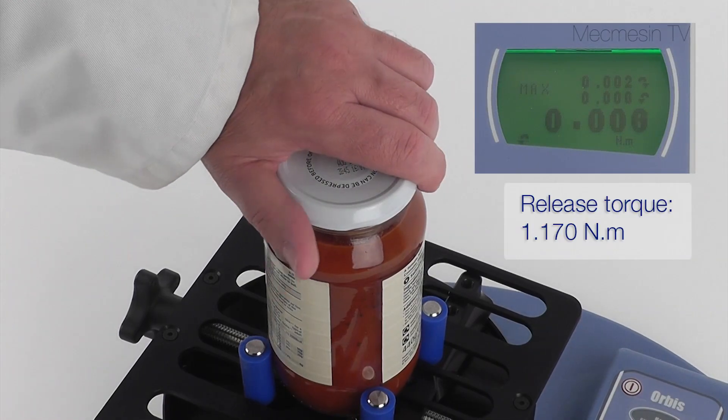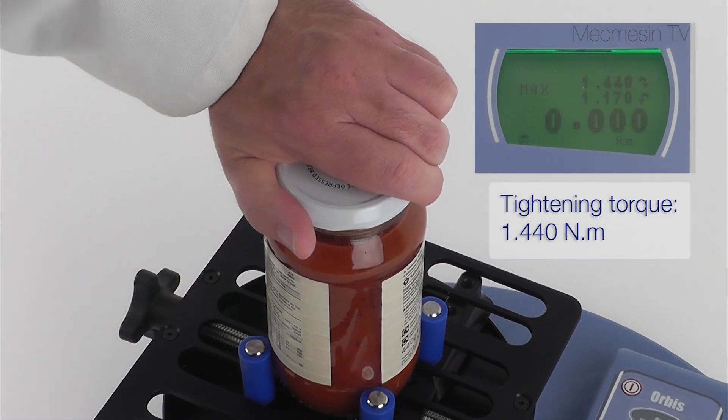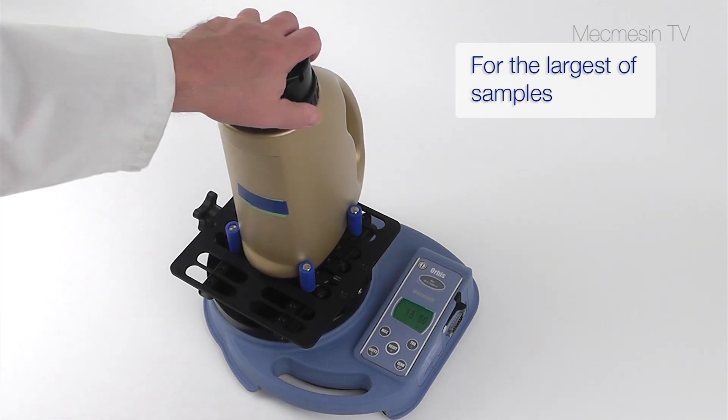The Orbis can measure clockwise or anti-clockwise torque up to 6 Nm, sufficient for most closures that are intended to be opened by hand, and can accommodate a variety of shapes and sizes.